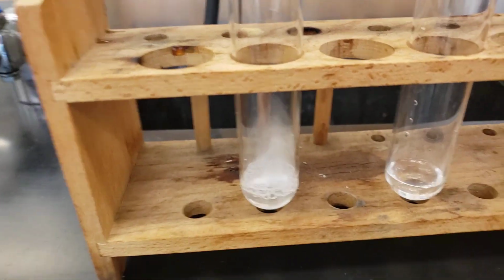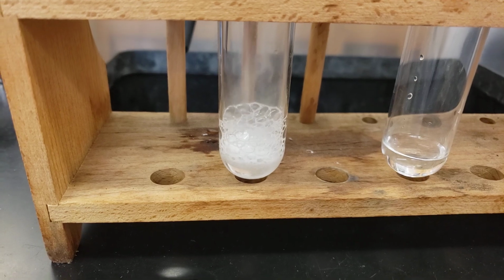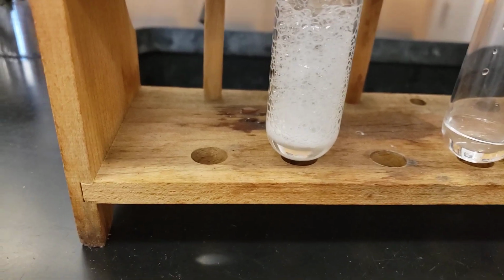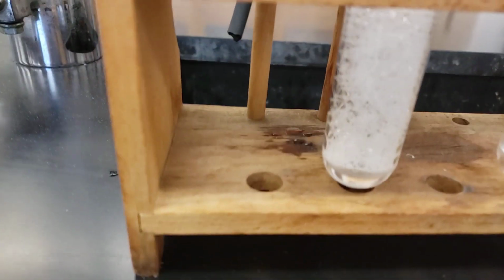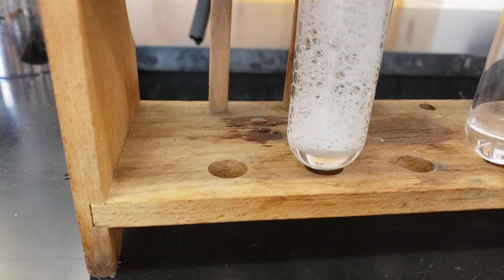So we drop in our magnesium and instantly things are a lot more exciting than last time. If you can notice, it is actually sitting on the surface. It is not getting underneath at all, but it is bubbling and fizzing, and there is even some steam coming out the top. It is quite the reaction happening with the magnesium this time.